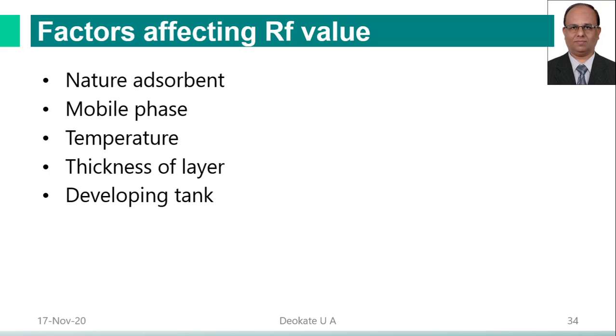The next factor is the developing tank. It is important that saturated conditions are attained for running the TLC plate. This is best accomplished by using small tanks with filter paper lining and sufficient solvent, and by leaving the tank to equilibrate for at least 30 minutes before running the plate.